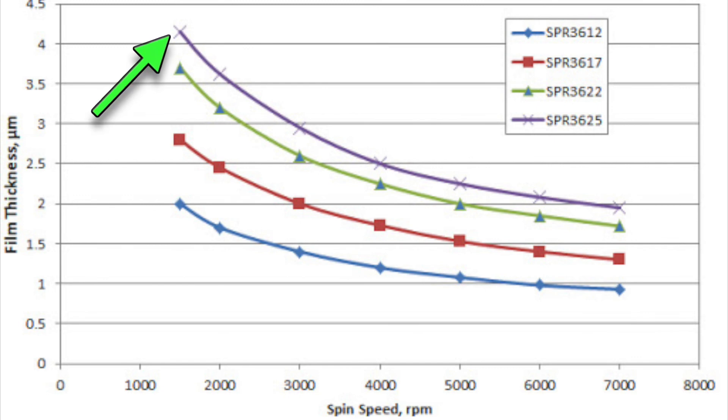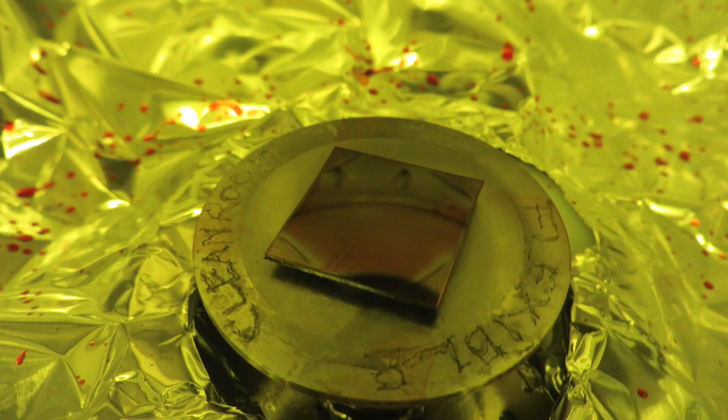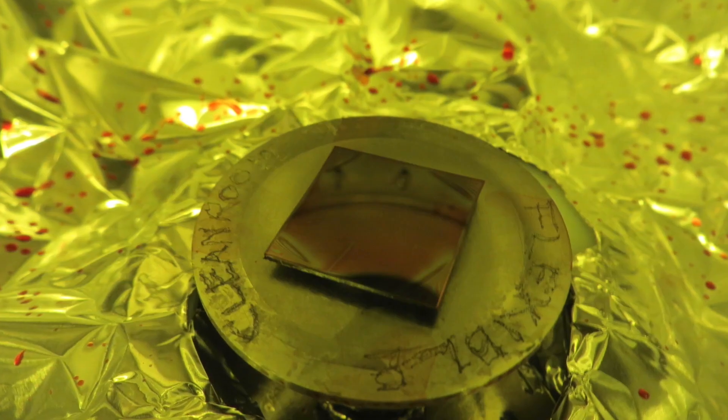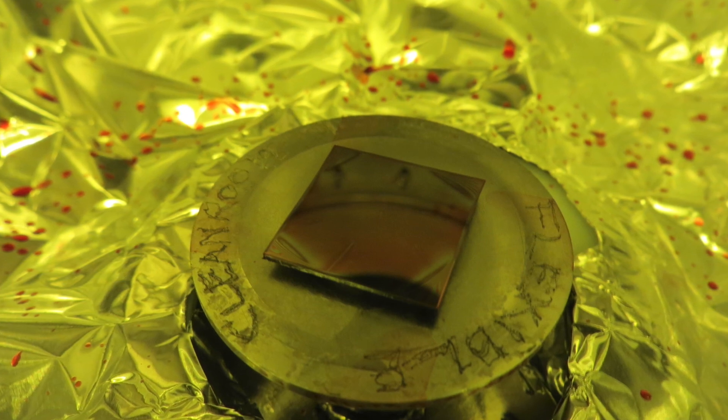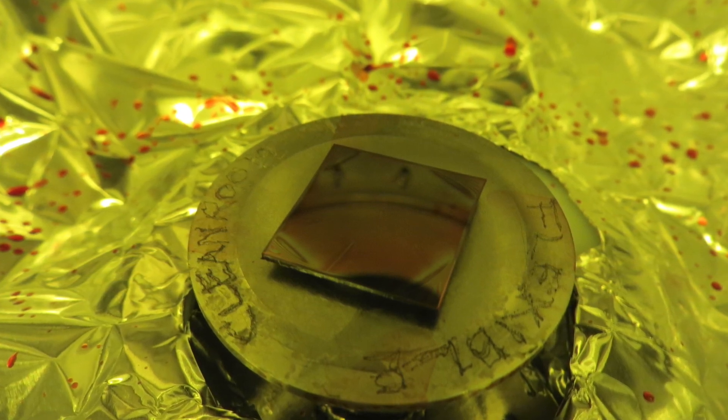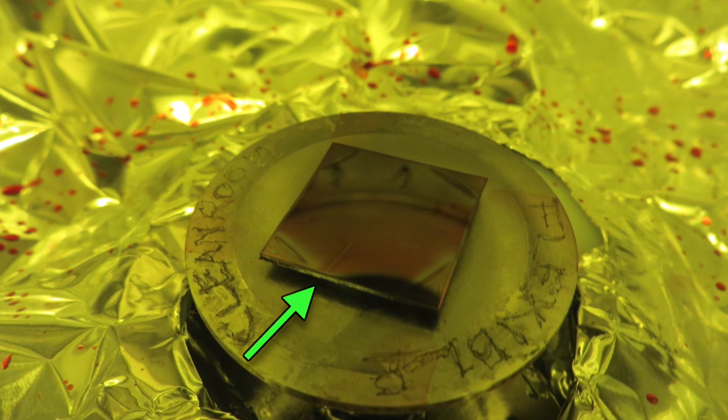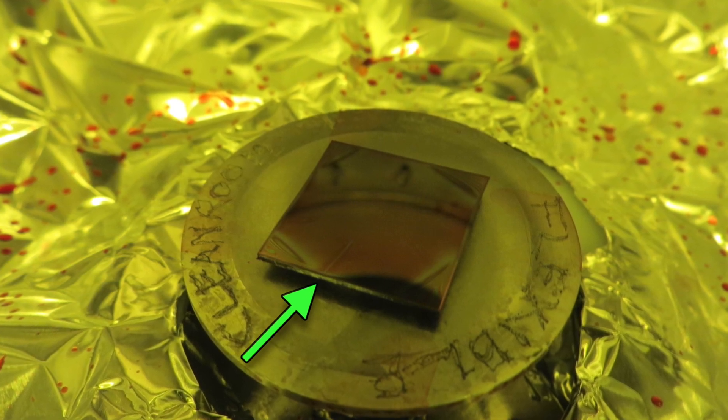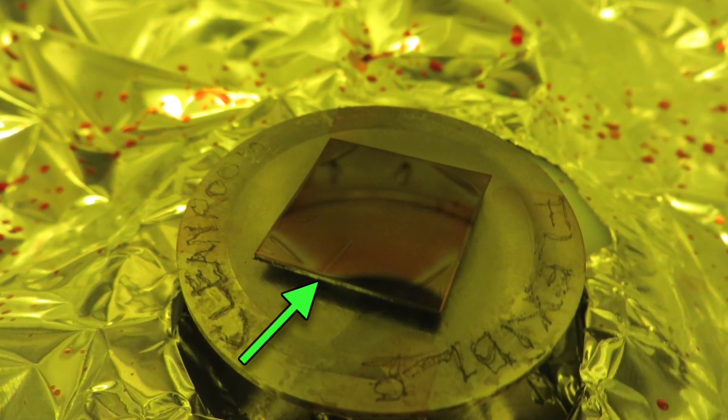Bubbles in the resist will also cause streaks. Squeeze out excess bubbles from the pipette before depositing the resist. If you do see a bubble in the resist after dispensing it, you can use the pipette to suck away the bubble or to scoot the bubble towards the edge of the wafer right before spinning.